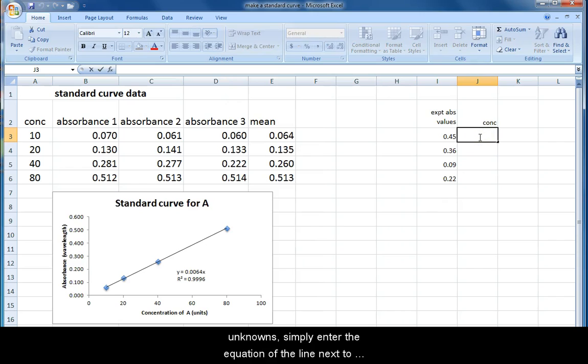To calculate the concentrations of your unknowns, simply enter the equation of the line next to your known absorbance value. The absorbance is the Y value in your equation, so reference the cell holding the absorbance value when you enter the equation. See video one for more info on entering equations.